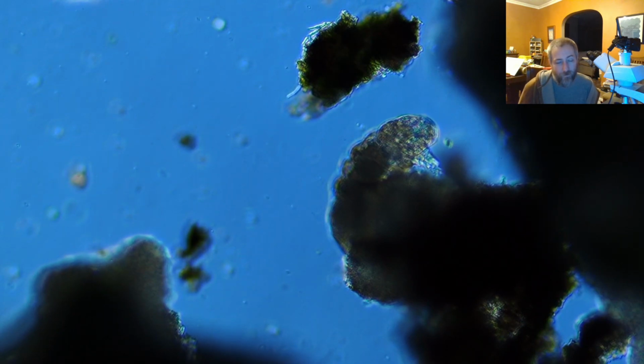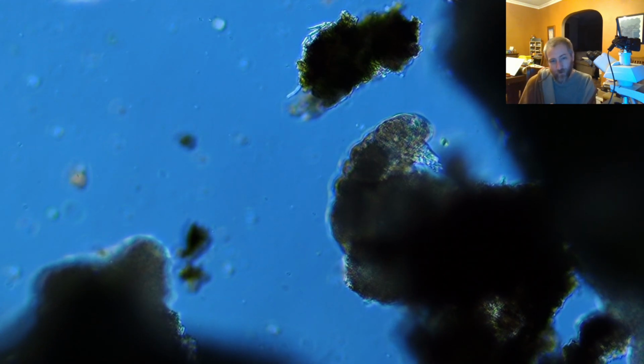So, for those types, they probably don't persist in really warm temperatures. They probably have a different sort of range. And I suspect it's really, really dependent on the species.